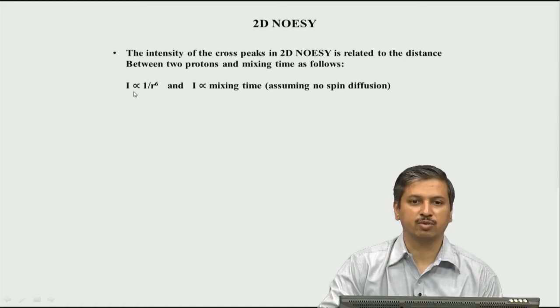So, this is the very famous formula. I is intensity, that is volume. When we talk about intensity in NMR, we typically imply area. So, keep in mind that area and intensity or volume of a peak, which can also be for a 3-dimensional spectrum, are all interrelated.